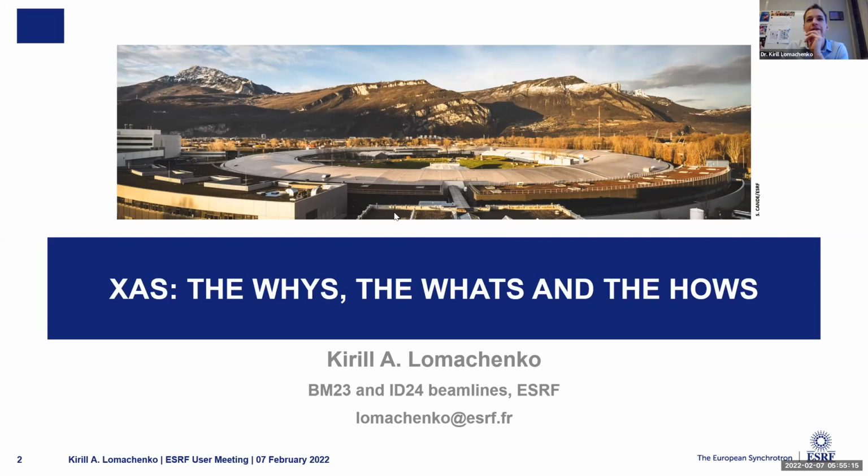Then again, a question from Romain: for a given system in which we expect disproportionation over time, what is the strategy that should be used to analyze the data, since the edge region shows an average oxidation state and won't move? I'm not sure I get the question, because you have no choice but to have an average in your XAS data.